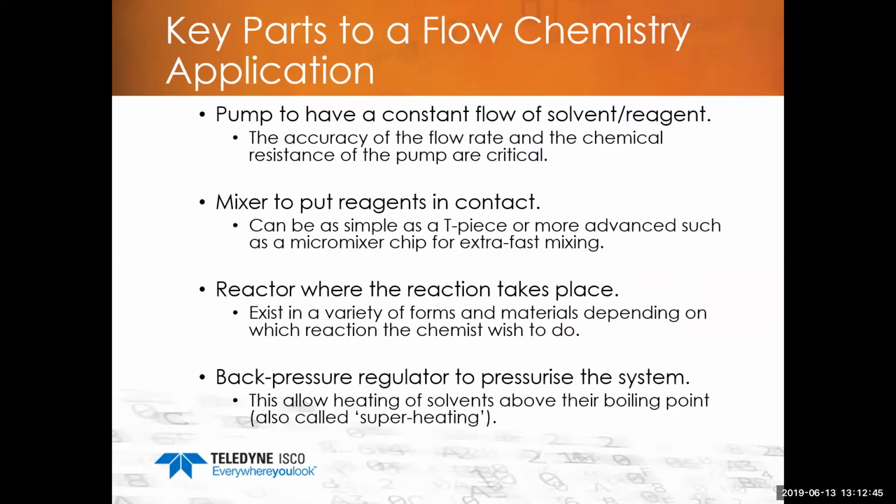So let's roll it back up to the top about flow chemistry. There are a few key parts to a flow chemistry application. First, the pump: you need the pump to have a constant flow of the solvent, reagent, or materials. And you really need to make sure you dial in the flow rate and the chemical resistance of the pump. Those are critical pieces.